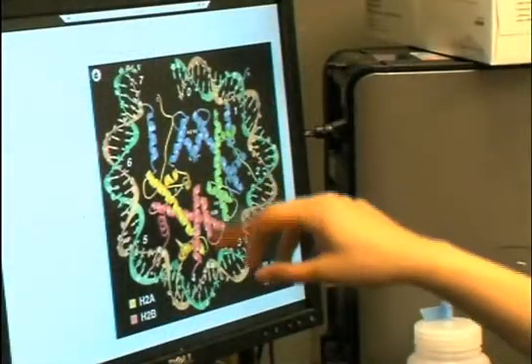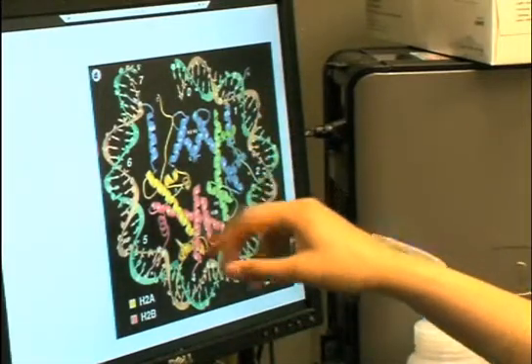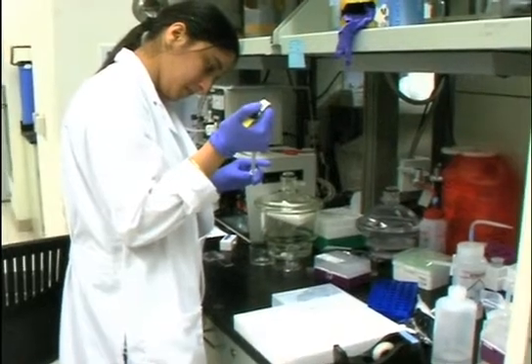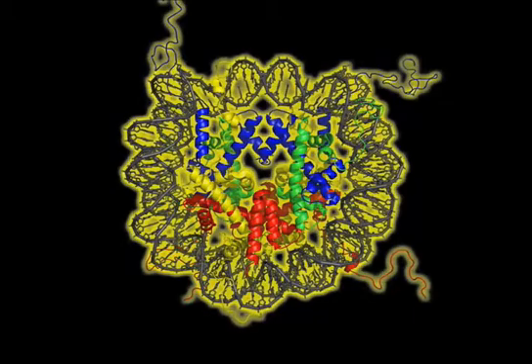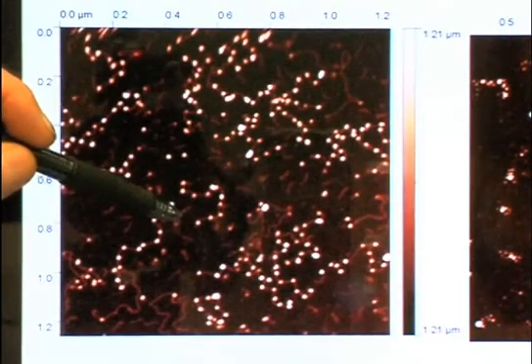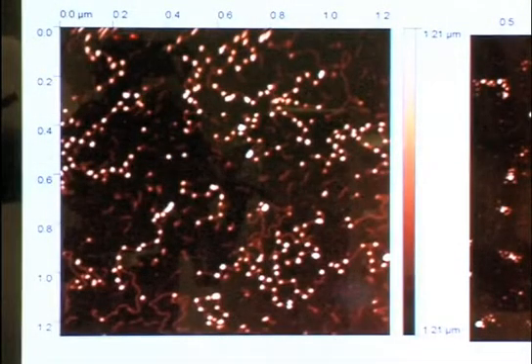One of Stuart's assistants is Parminder Kaur. That's a core of the histone, and this is the DNA all wound over the core of this 8 units of the histone there. The team is studying the interactions between DNA and the different types of histone proteins in the nucleosomes to understand how and why genes are expressed. So using images like this of individual molecules of chromatin, i.e. the DNA plus the factors that control gene expression, we hope to see how all these various modifications conspire together to either express a gene or suppress a gene.